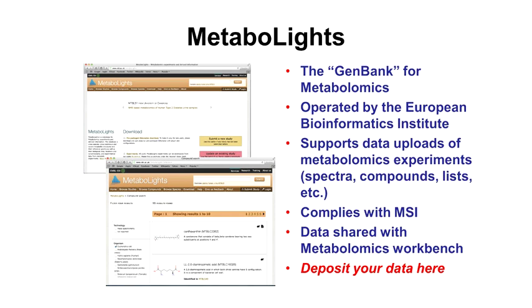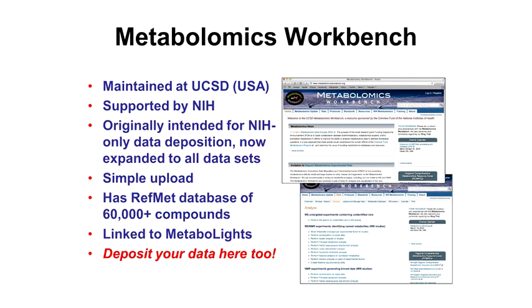So certainly MetaboLights is one of the best places to deposit your data, and there are tools developed by Metabolomics Australia to facilitate that. A slightly simpler way of depositing data is to go through the US Metabolomics Workbench. They have a lower threshold for what's being deposited, so the deposition effort is generally a little easier.